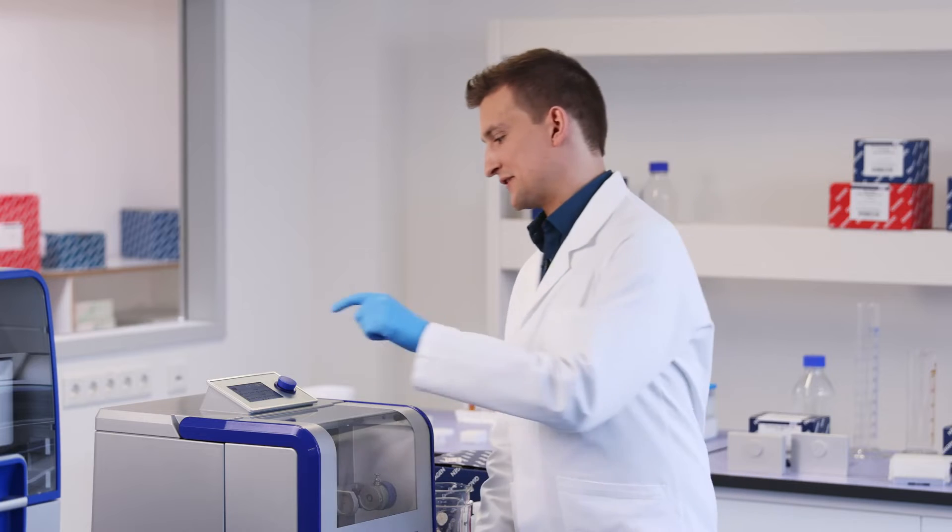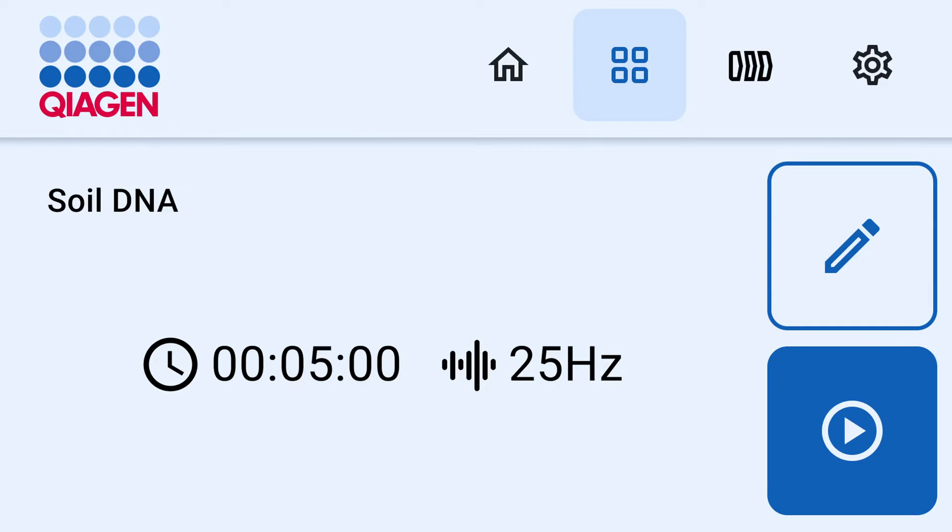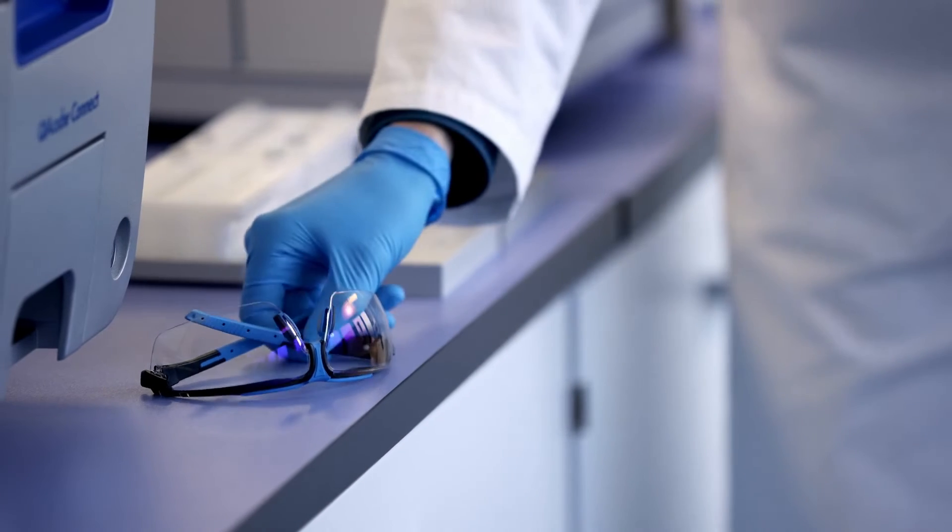For our trial run today, let's select Soil DNA from the list of programs. Now that we have selected our program, let's prepare our sample.